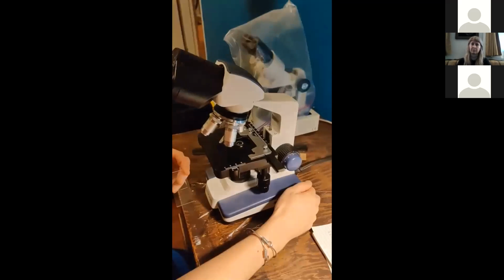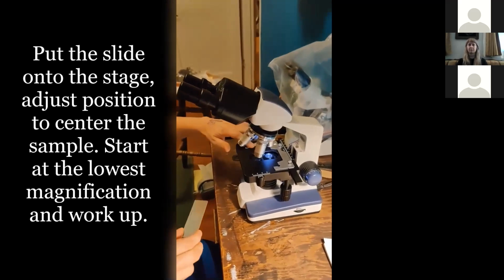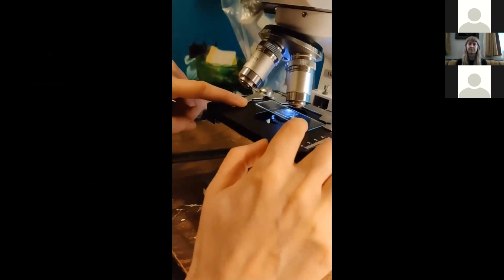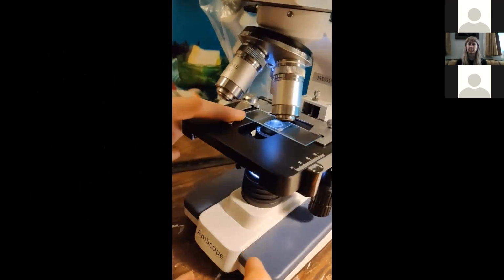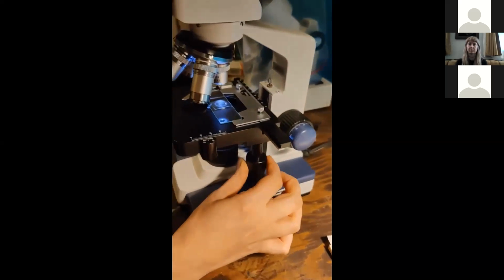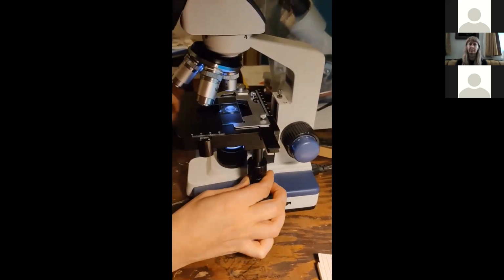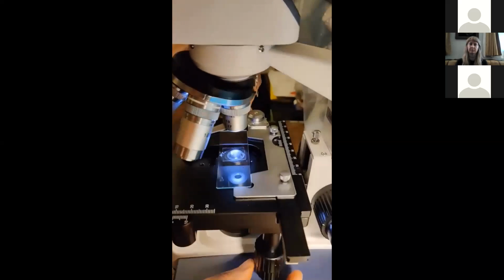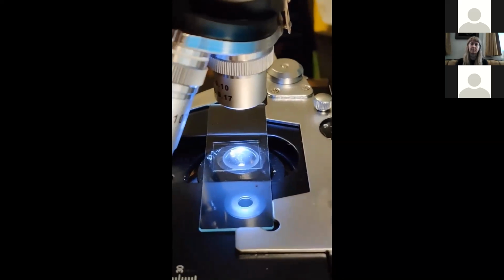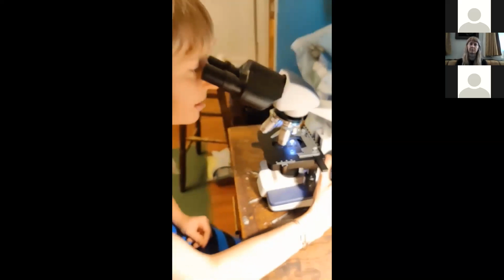Okay. And then I'm going to turn on my microscope. And there's this little arm here, and I'm going to put it inside here. It gets held with the edge, and the arm goes into place. And then I use this thingy right here to adjust where the slide is. And I make sure that it's lined up with the objective here. And then I'm going to look through and see if I can see anything.